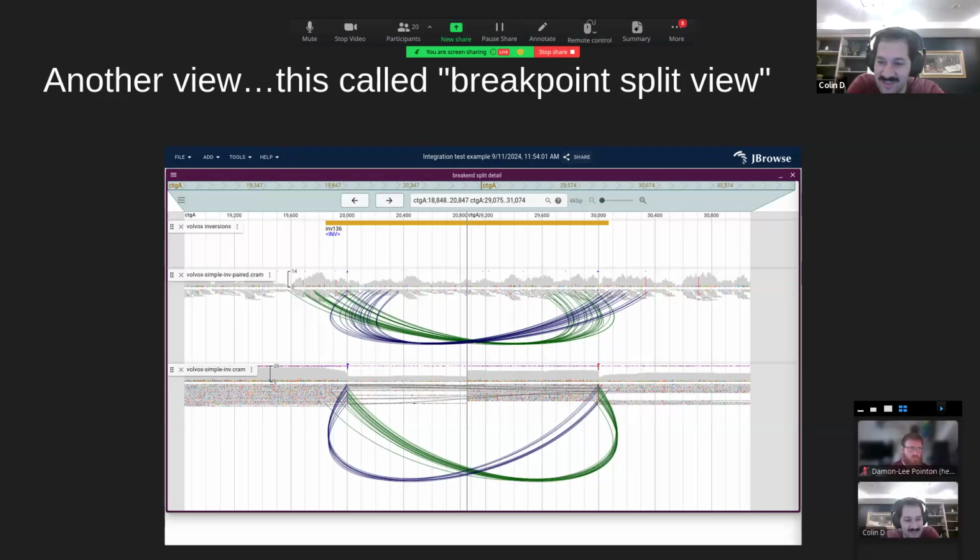But that is a possible workaround. Another way to do it is to create, I know I'm really just pulling out all the stops here, compressed representations, which may be lossy. For example, you can just do a bigwig of the coverage.